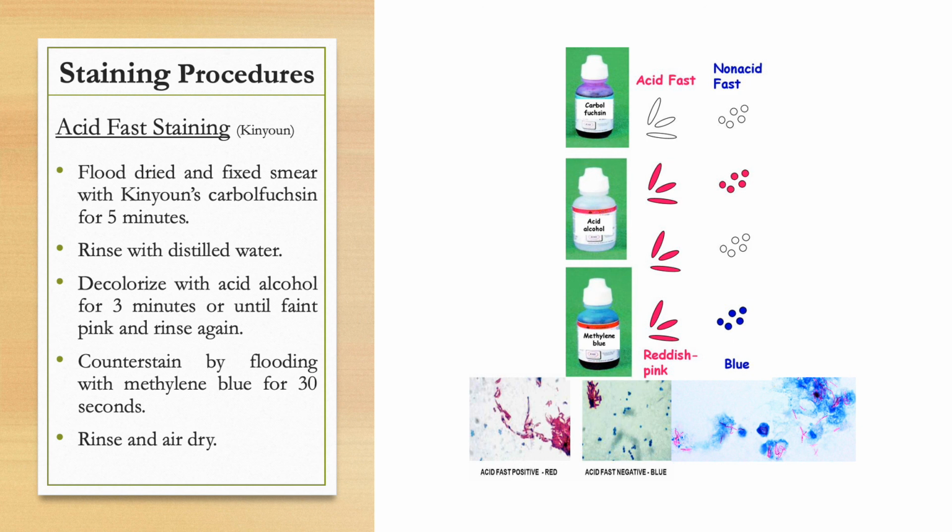All right, so to do this, you first need to flood the dried and fixed smear with your Kinyoun's carbofuchsine for 5 minutes. Again, the Kinyoun's carbofuchsine is a combination of basic fuchsine and phenol.